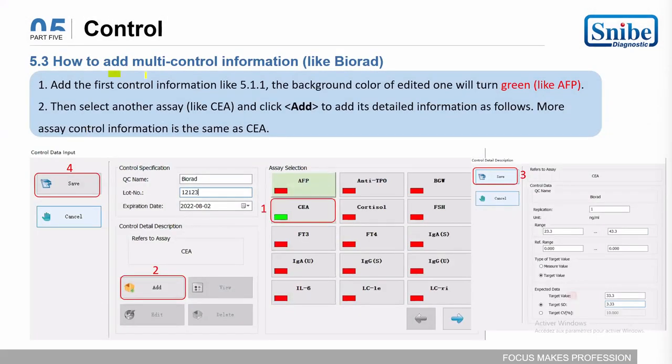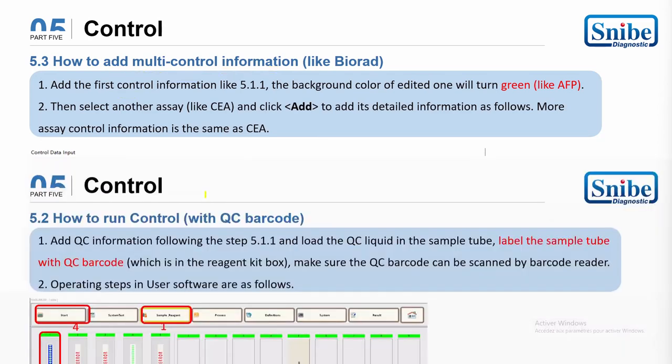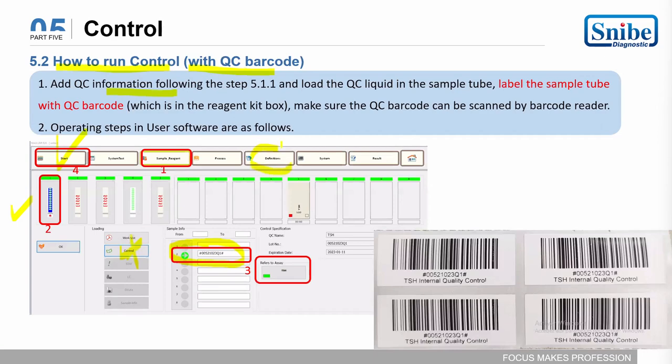Then how to add multi-control information, for example from Biorad, third party. You need to add the information in the same interface, definition.